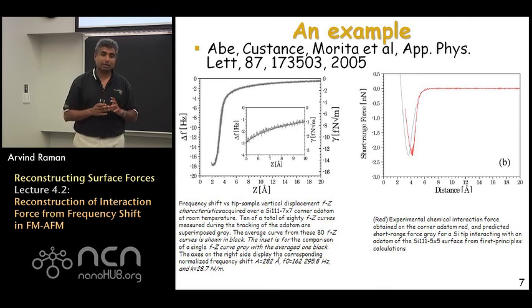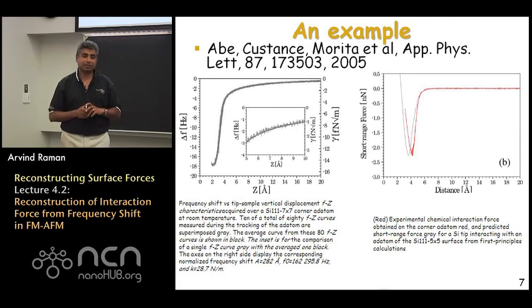So there are very important conclusions in the frequency modulation force spectroscopy community of looking at the trends of these interaction forces, because they tell you a lot of information, especially about chemical forces, short-range forces, which is of a lot of interest in surface science. So with that, I'd like to conclude, and we'll continue our discussion about some practical experimental issues in FM-AFM in the next class.